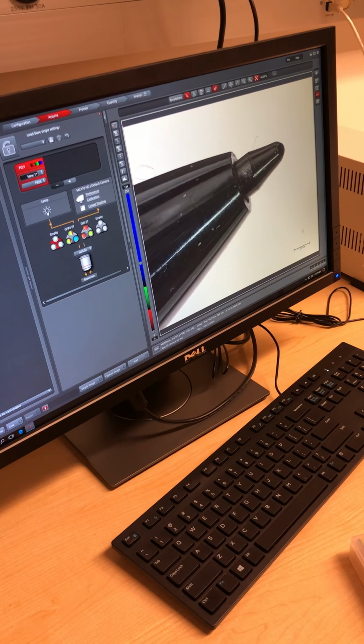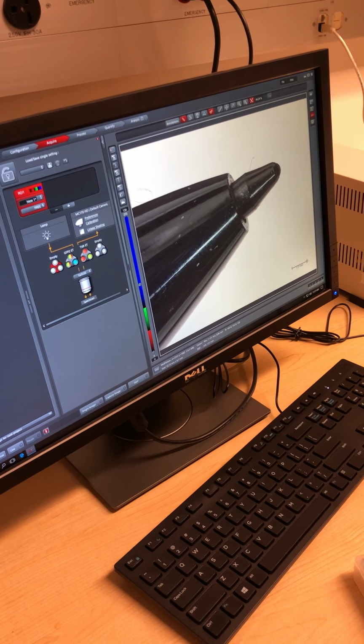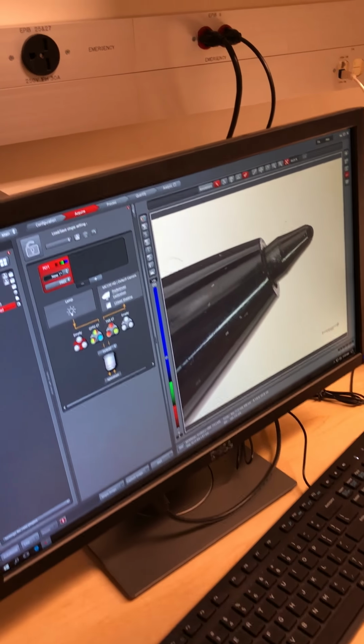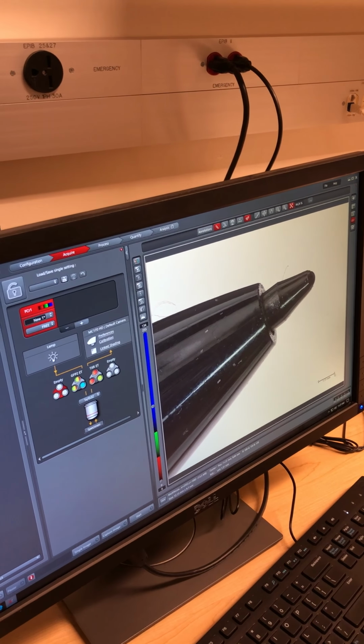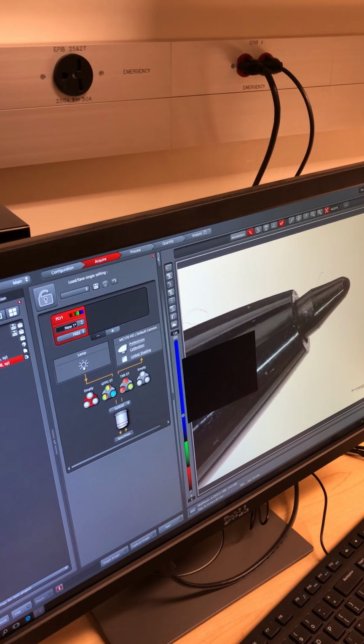Right. And you have to draw it. You can't just specify. What do you mean? Specify the size? Finding the angle's annoying. It's just nice if it just pops up as a flat scale bar that I can then say, oh, I want it to be 100 or 110 or whatever, rather than having to draw it each time.